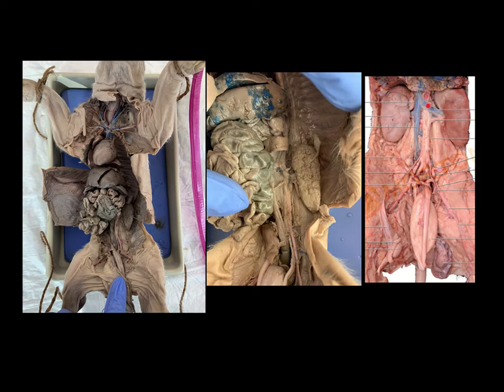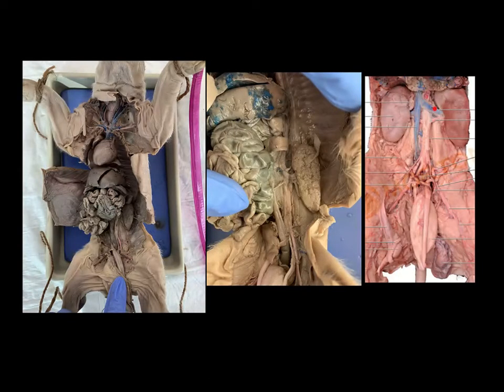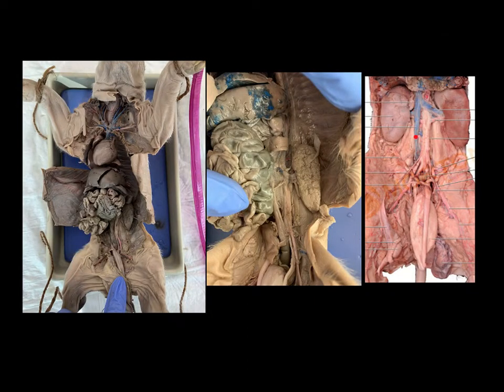Here's that left renal vein that we saw over here in this image. But we can also see here's the right kidney, and it's got a vein coming out of it, also very, very short. This is the right renal vein, and both of them are connecting to this large blood vessel right here. This is that inferior vena cava, which was behind that membrane that we see right here. So we can see the left renal vein, the right renal vein, and the inferior vena cava.